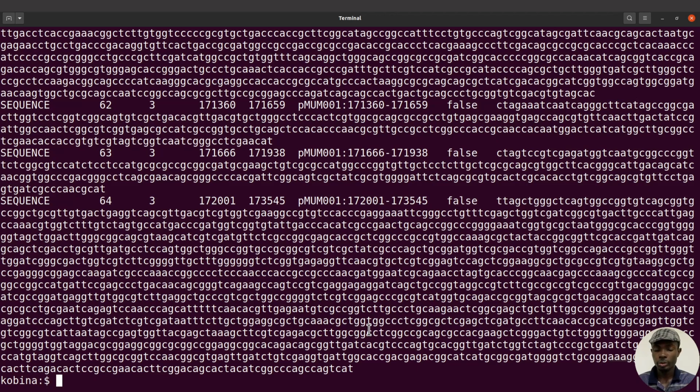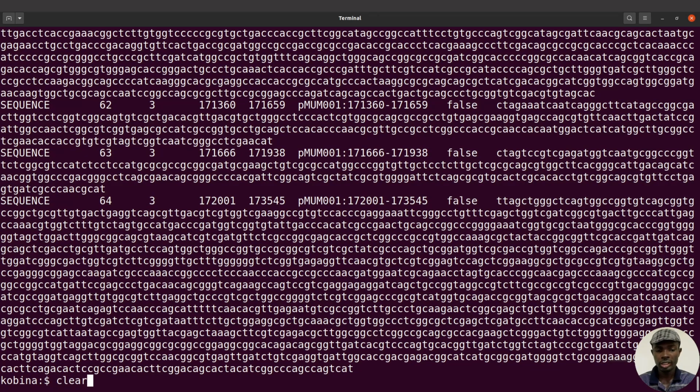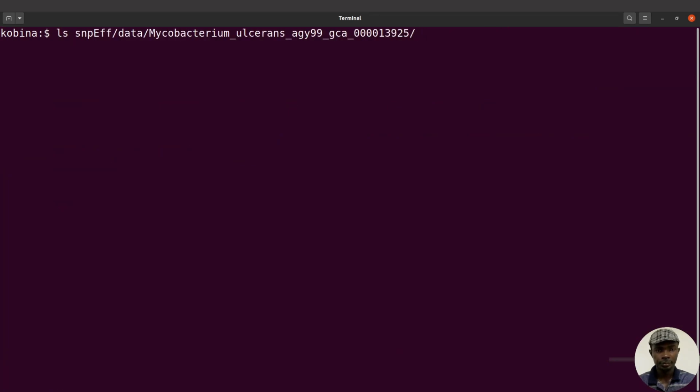We can proceed with resolving the issue. All right. So now we have the plasmid, which is this one here. If we had plasmids in the VCF file, then we would have also factored that in. But because we don't have plasmids, we can ignore this one. So what we are going to do next is to check this one also, because this one says sequence of chromosomes. So that means definitely what we are looking for will be here.